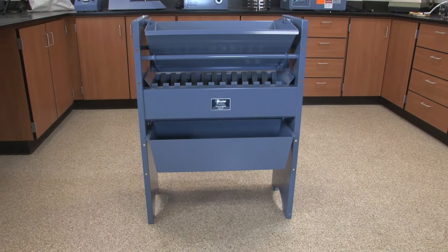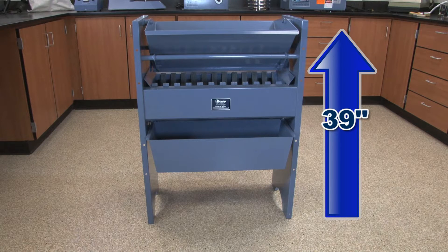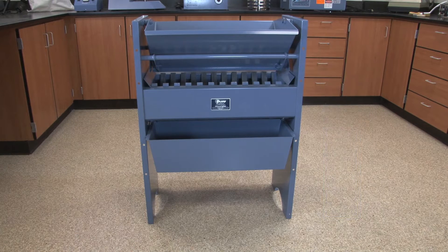At 39 inches tall, the SP-1 is ergonomically designed for loading large bulk samples, convenient for both lab and field applications.